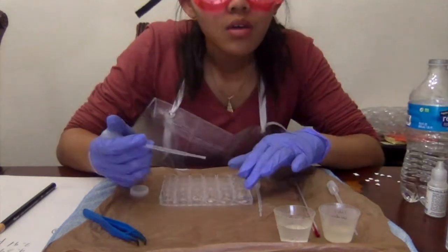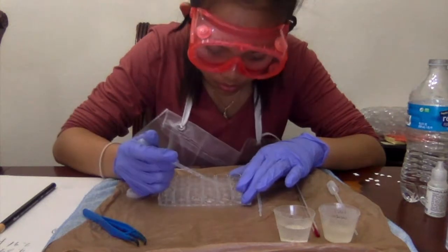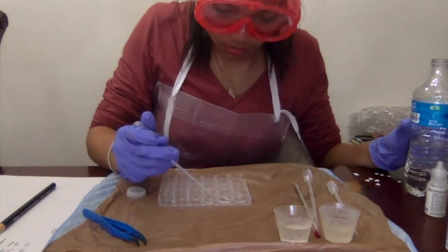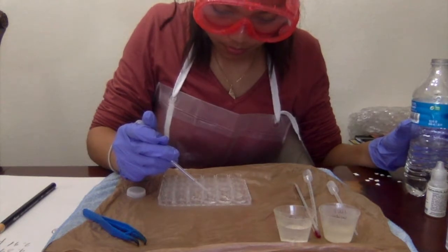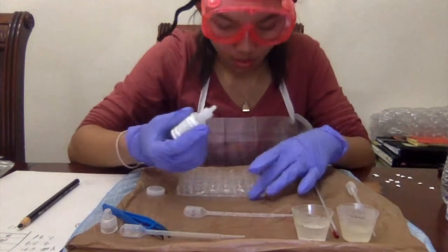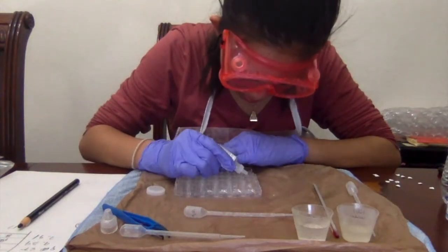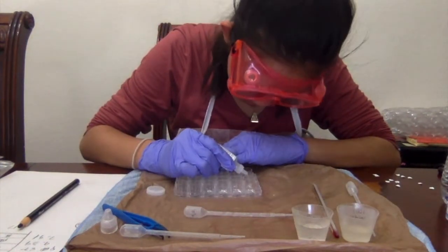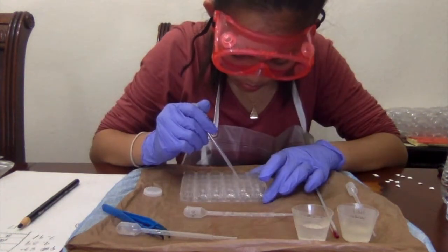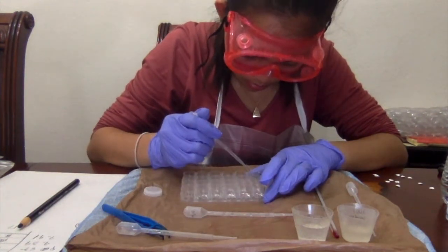The reaction rate for each pH was 0.0186, 0.0328, 0.1119, 0.1284, and 0.1258 respectively. The pH of hydrochloric acid did affect the catalase enzyme reaction to some extent. As the pH increased, the time decreased and the rate increased up until the pH of 5.3. Here the reaction rate began to decrease slightly as it took longer for the disk to surface.